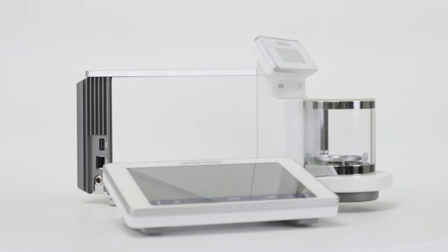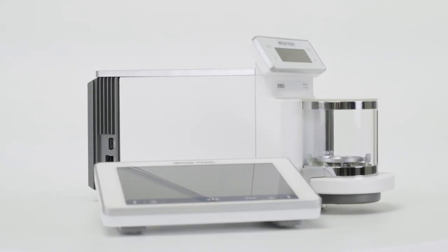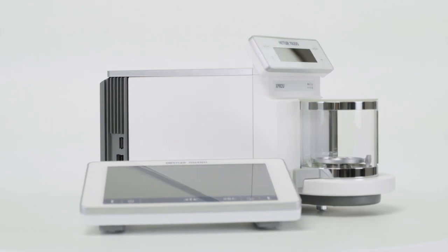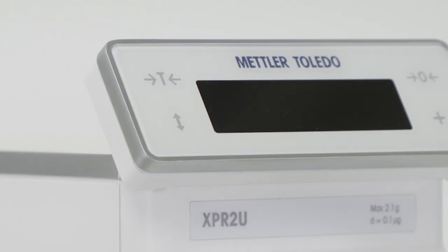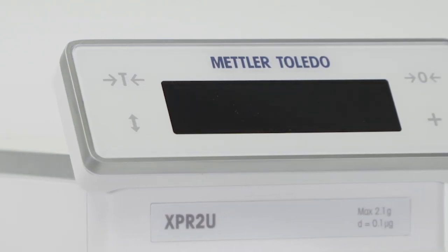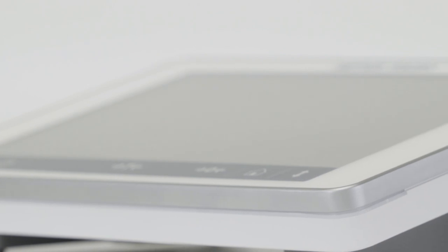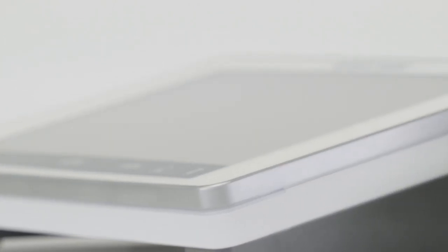Mettler Toledo Excellence Level Microbalances offer unmatched accuracy and high comfort for handling large numbers of very small samples. The convenient SmartView terminal helps during the delicate weighing in process and the main terminal can be placed away from the balance to save space in your fume cupboard.